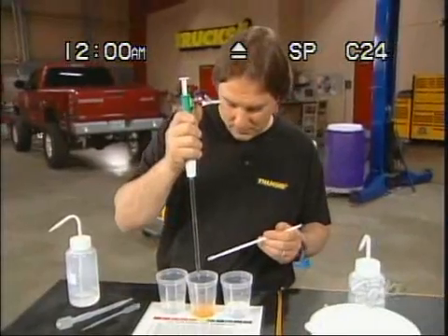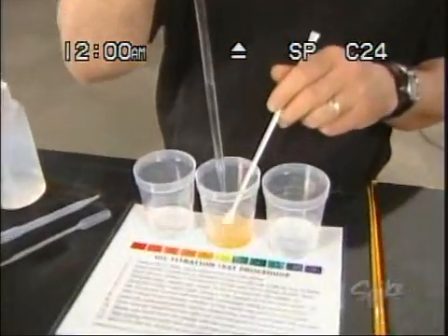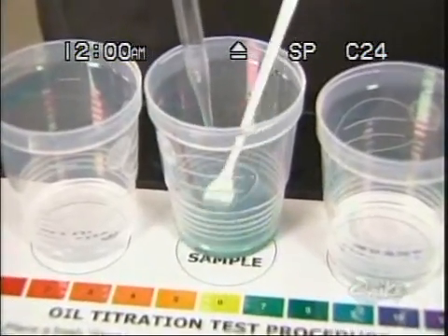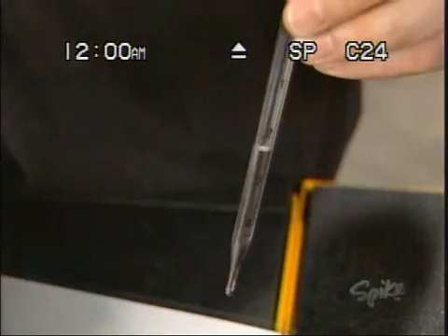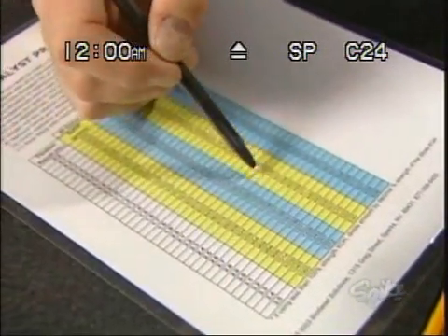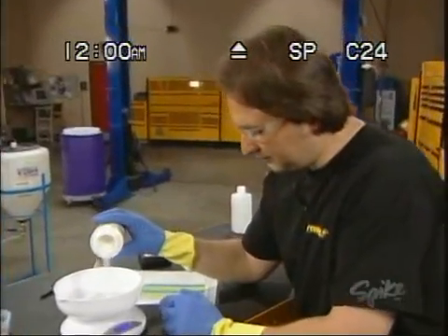So we'll take a measured amount of the titrant and slowly mix it into the sample cup until the color indicates a pH of around 8 or 9 — kind of a bluish green. The amount of titrant you used is then compared to the chart for the size of batch you're going to make, and that gives you the amount of lye you're going to need to use with this oil. See? That's pretty simple.